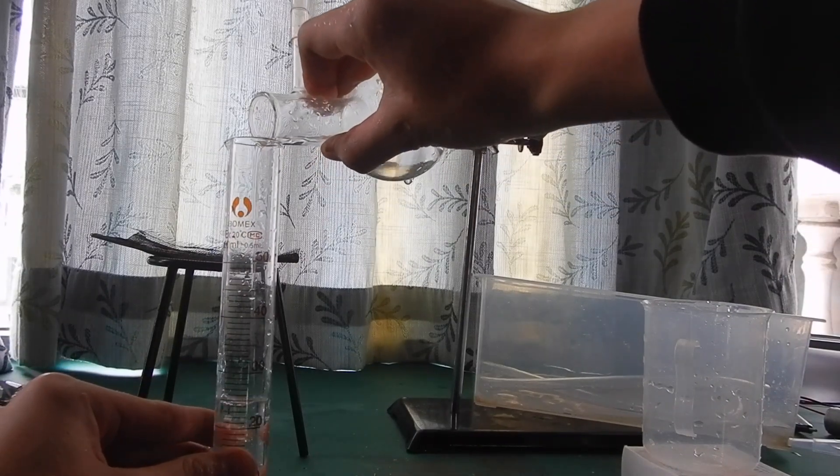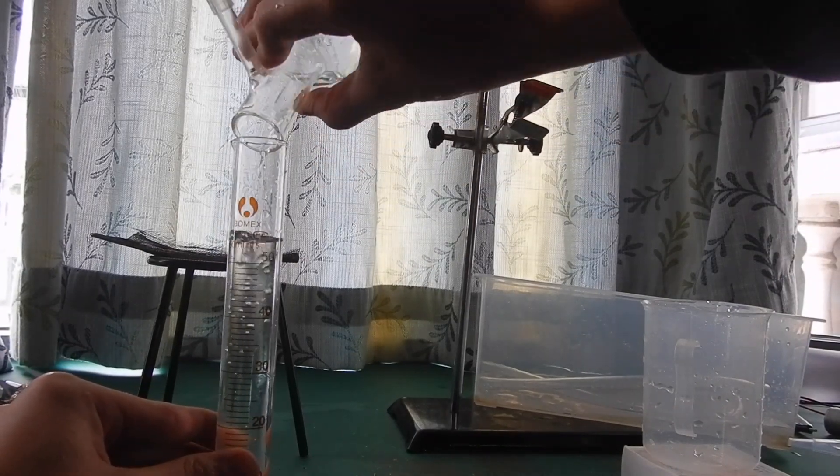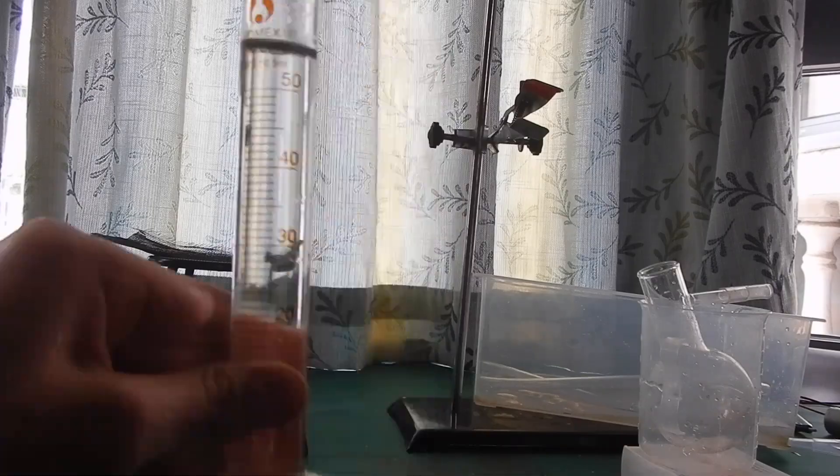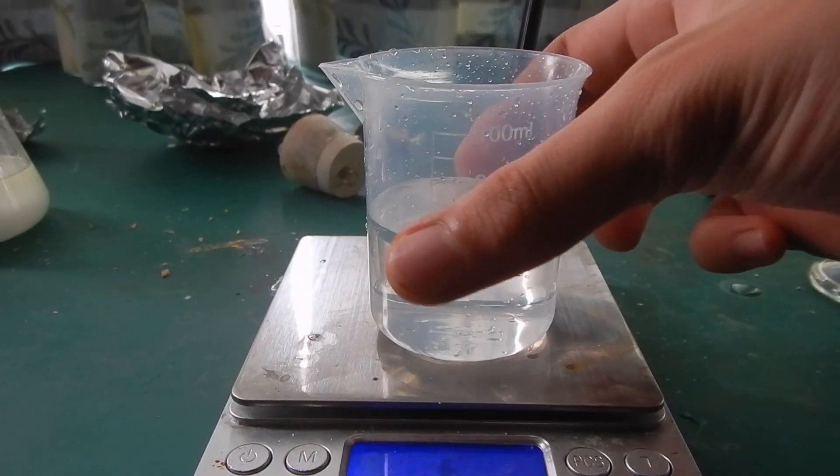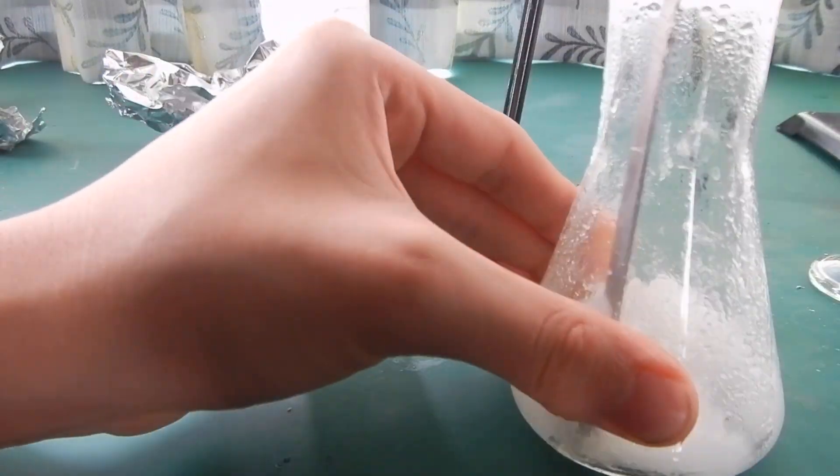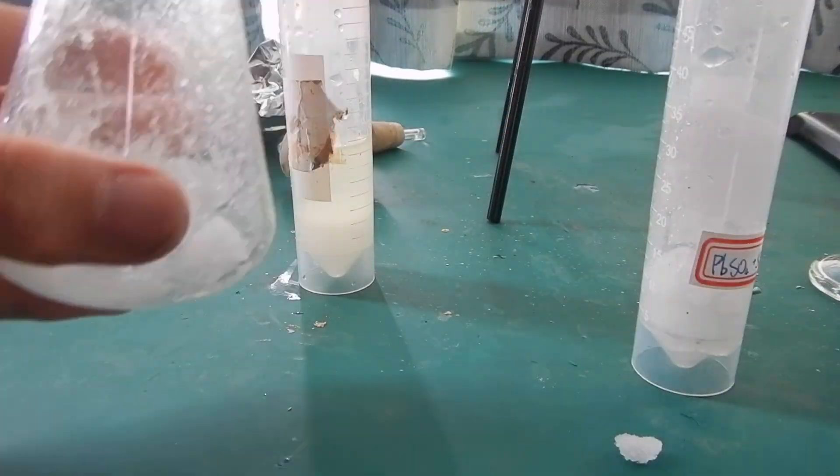I poured the distillate into a measuring cylinder, and it is about 55 milliliters. I then weighed it on the balance, and it showed 66.5 grams. I also scraped out the solid in the flask, and put it into a separate container.